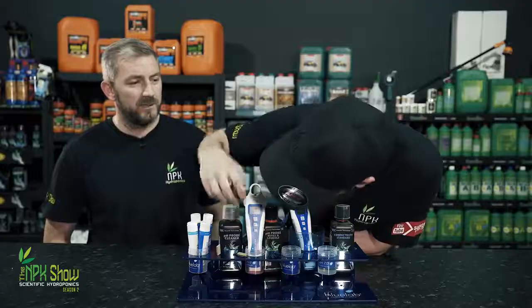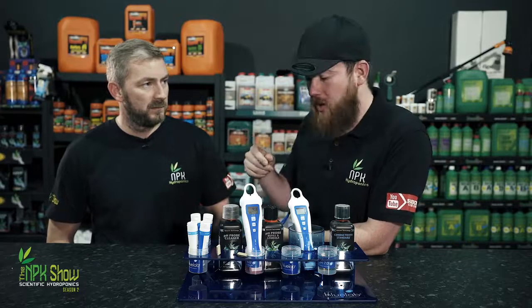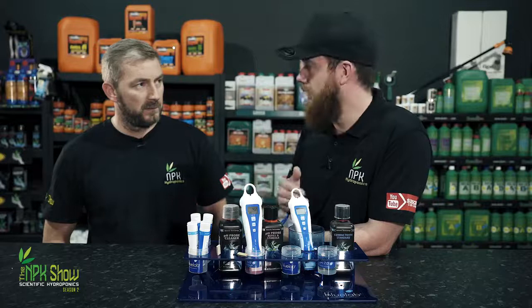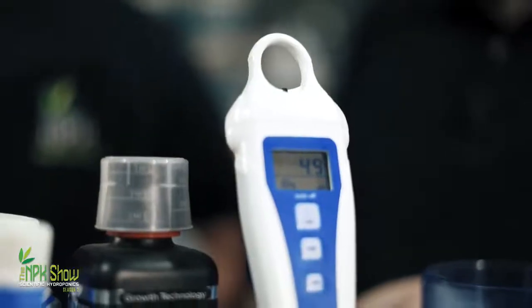So how long does it roughly last? The calibration will last a month before the tick goes. So it's not on the usage of it? No, it's not usage. You could use it 10 times a day and it won't uncalibrate it. You could use it once, the tick will still go after a month. So the tick going doesn't mean that it's not calibrated. It just means that it could do with the calibration and it'd like to be calibrated again.